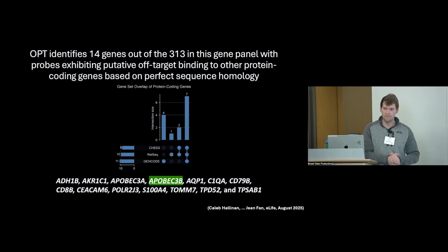Because each probe is just one bit in the optical barcode. So even if one of them is wrong, the next ones for that gene that you care about shouldn't be binding still, right?